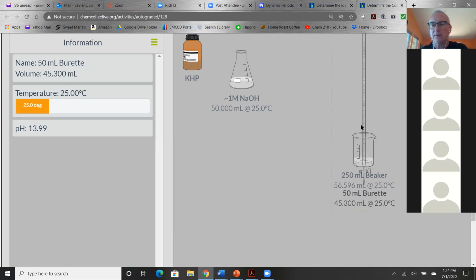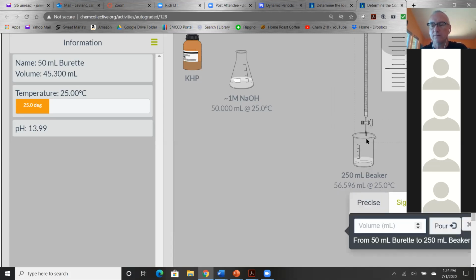Don't put my burette back over it. I'm at 7.05 pH and I'm still not turning pink as well. Oh, mine is 11.07 for the beaker when it turned pink. Yeah, it'll be a big difference.